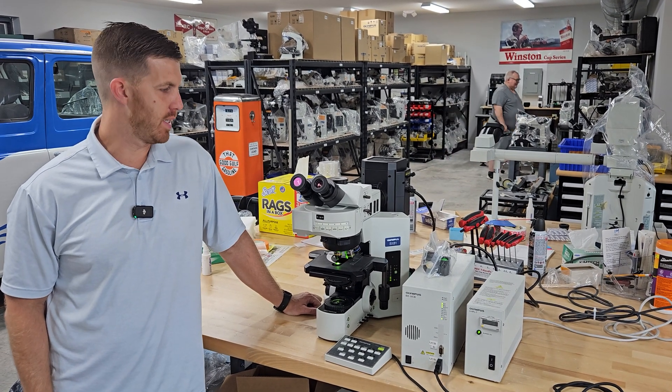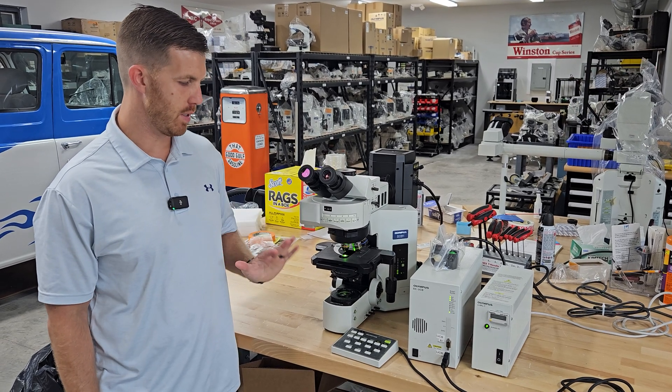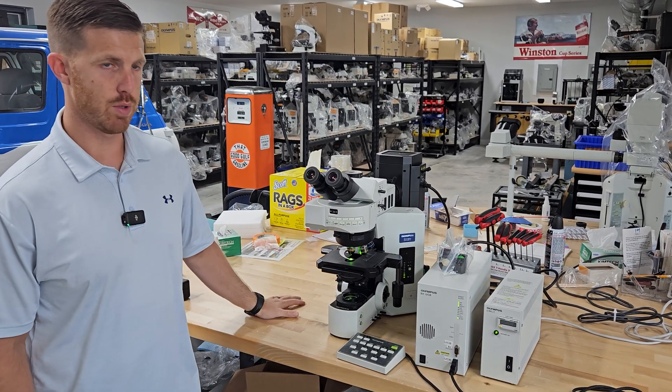Hey, this is Chad with Monday Scientific, and today we're going to go over this Olympus BX61. We're going to show you some basic features, how to use it, some important things about the cables, where they go, and just a couple little things we're going to talk about.